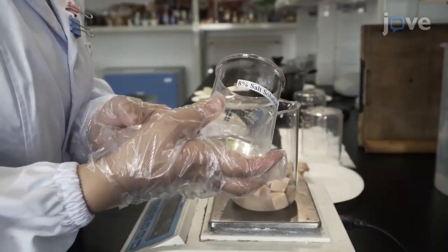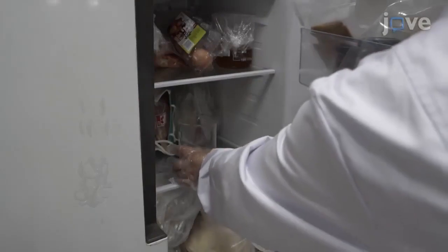Next, mix the fish cubes with 6 to 12% salt solution at a ratio of 1 to 1 at 10 degrees Celsius for 1 to 3 hours.